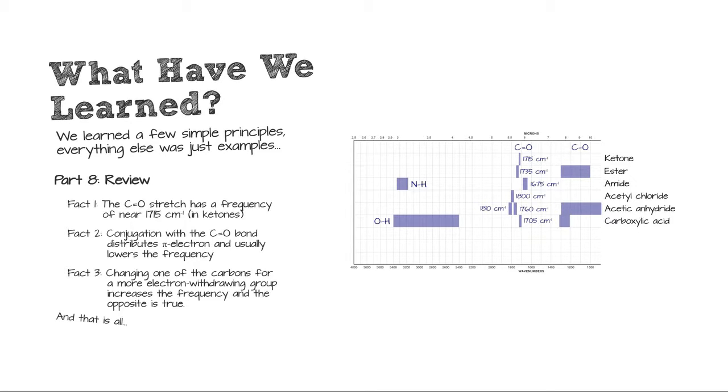Then you have the carboxylic acid. With that, you expect to see this really broad, much lower in frequency than expected OH peak. Sometimes it's so broad it's hard to spot. You think it's just a lump or a bad spectrum, but keep an open mind. And again, it's not a tremendously lower signal, but it is a little lower than ketones. So if you're slightly on the low side, you've got a carbon-oxygen single bond, and you have this big lump messing up your whole alkane stretch region, carboxylic acid.